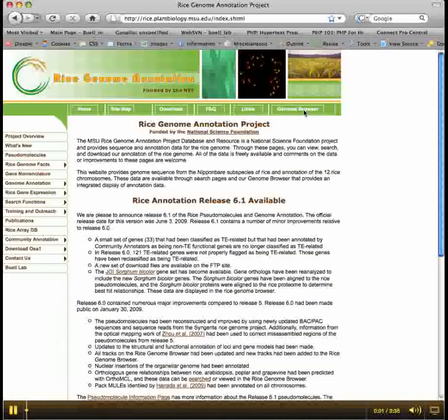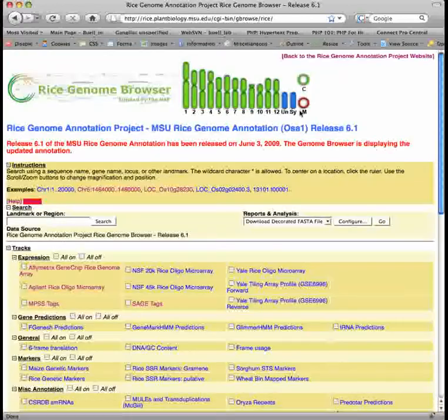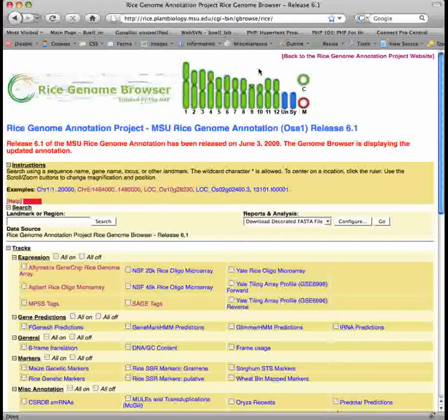The MSU Rice Genomics resource has mounted a genome browser to graphically represent annotation of the rice genome. You can select regions of the rice genome to view via the graphical representation of the rice genome at the top right of the page.